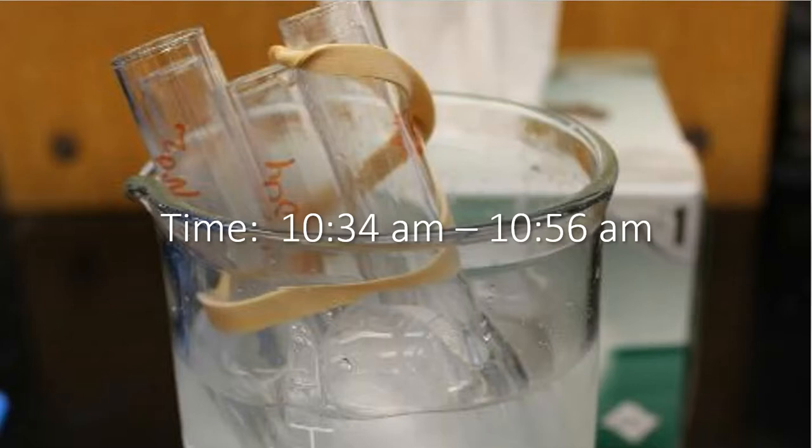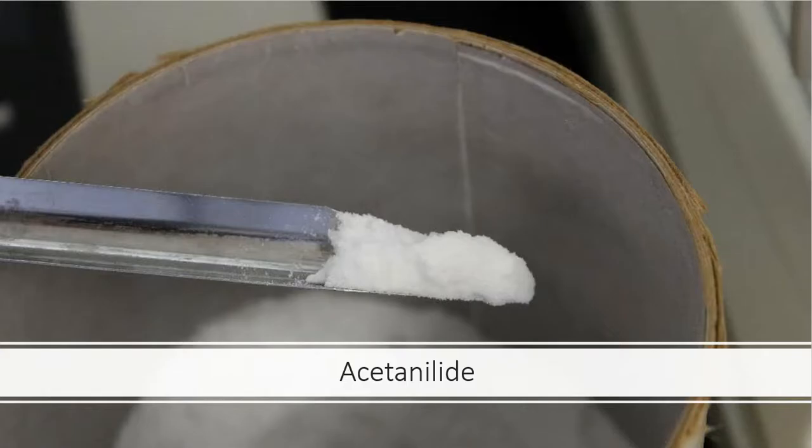And now I need to turn to my benzene reagents. What are we going to be using? All right. Well, the very first one that I decided to weigh out or to use was acetanilide. This is what acetanilide looks like.